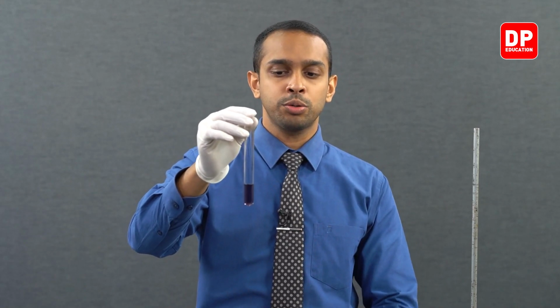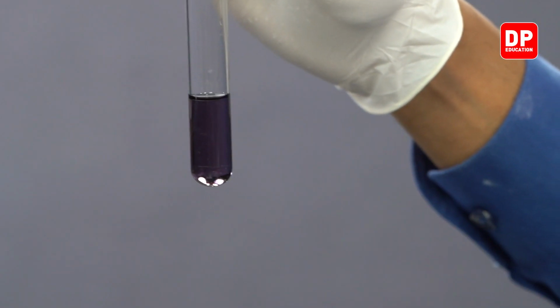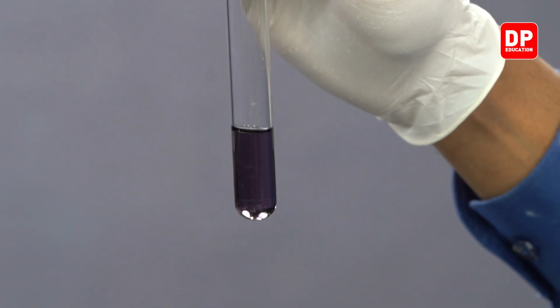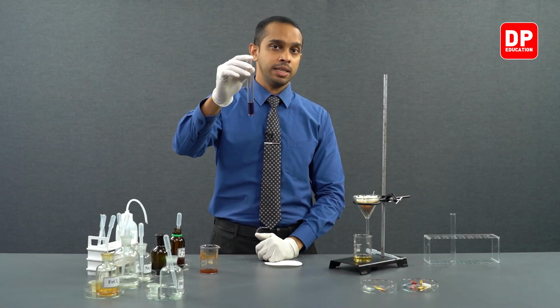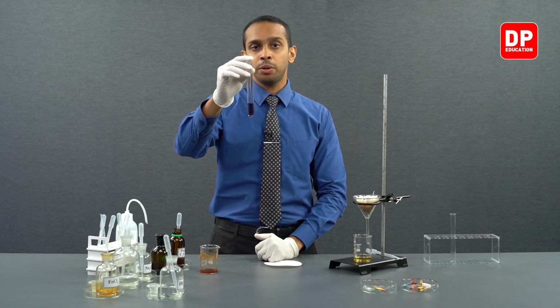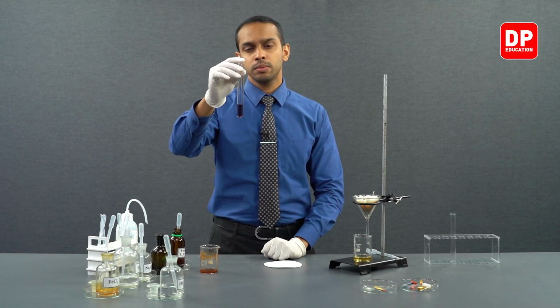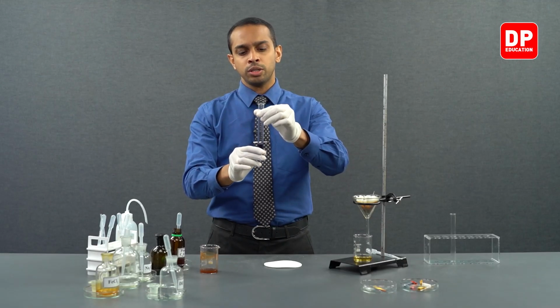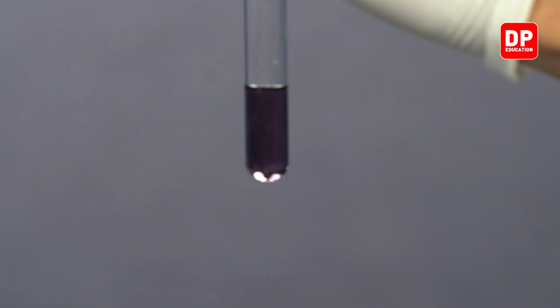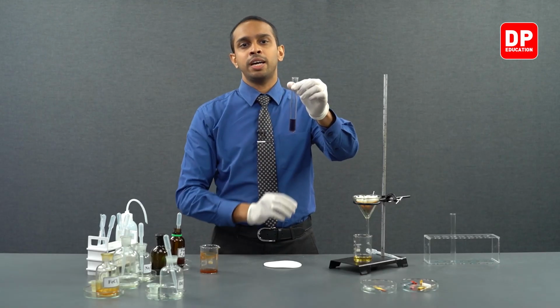If you react neutral ferric chloride with phenol, you will see the formation of a complex between Fe3+ ions and phenoxide anions, which is violet in color. This could be used as an identification test for phenol. And now we are going to add a small amount of hydrochloric acid to observe what happens when we acidify this medium.